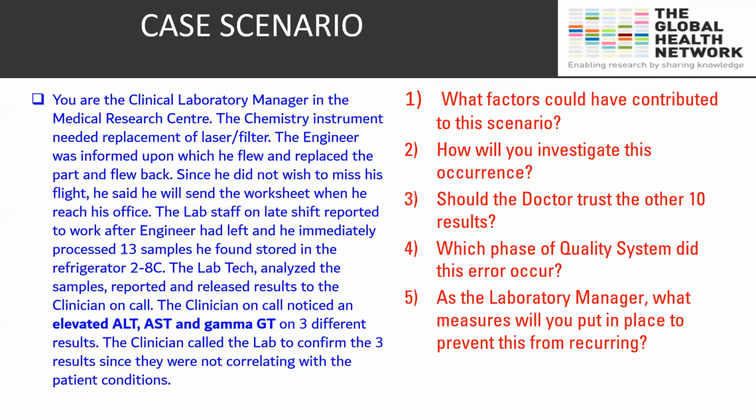Root cause analysis and take corrective actions. Root cause analysis and corrective action. Put CAPA in place. SOP. Provide proofs or documentation of services performed, proper training of staff on SOPs, ensure flow of accurate information between staff. And that is documentation. Documentation, very important. We're going to talk about, there'll be a topic on documentation coming.